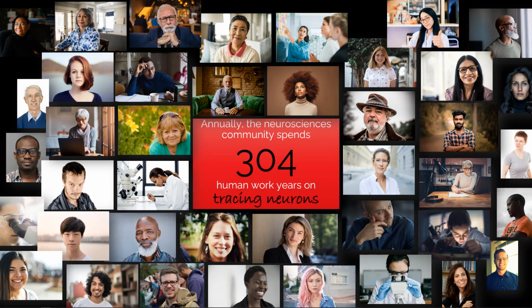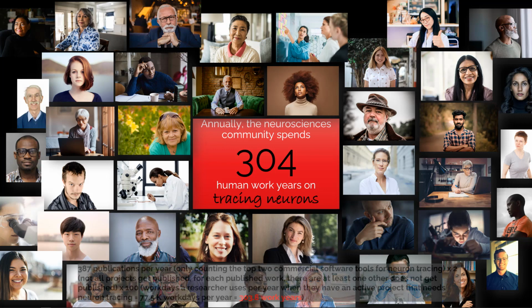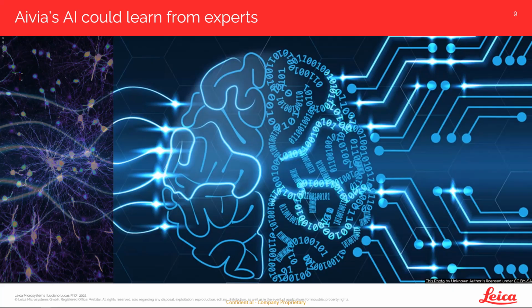In fact, we estimated that globally, and this is an underestimate for sure, more than 300 human work years are spent tracing neurons. In this one task, 304 work years from this community of neuroscientists. That's a large amount of very manual, repetitive work, which we think could be streamlined and automated for the benefit of science, for the benefit of human health and human life quality.